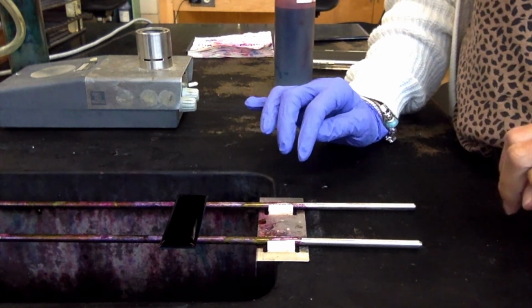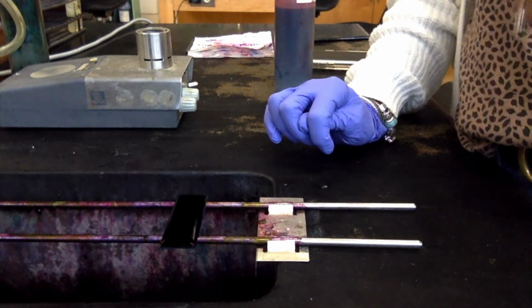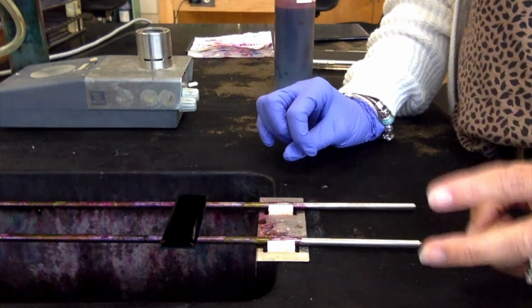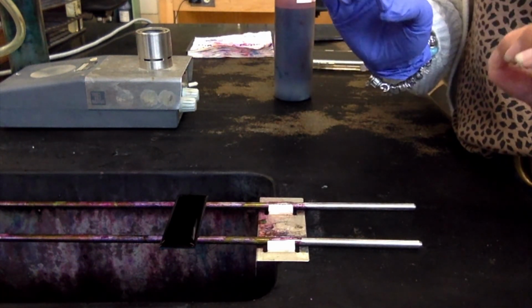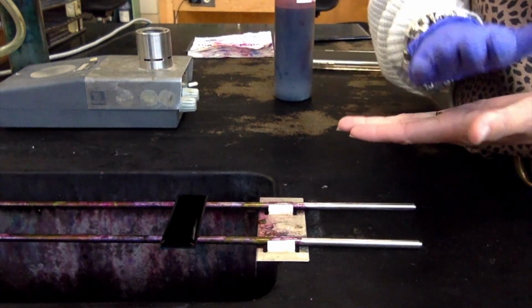This does two different things. Number one, it heats the stain itself, strengthening the staining power of the malachite green. And then number two, it creates holes in that DPA, that spore coating, so that our stain has somewhere to go. So we're basically cooking this malachite green into the spores.